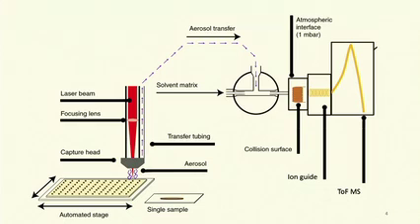The transportation of the laser energy on the sample surface will rapidly heat the sample, creating a vapor. The vapor will be caught by the sample transfer tube and transported to the level of the source. Here, the sample vapor will be mixed with the solvent matrix. The solvent matrix serves two main purposes. First is to dilute the sample vapor, and second, to promote ionization of single molecular species.